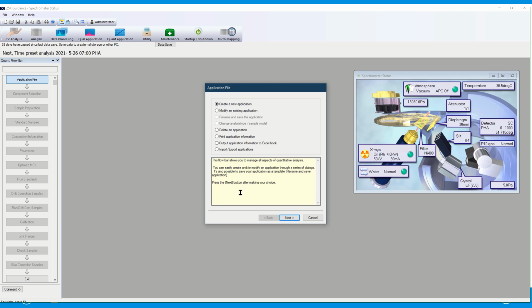So the calibration we ran with these pills before is for the class 1 and 2A, which is your arsenic, lead, mercury, cadmium, cobalt, nickel, and vanadium. But we're just going to do this with nickel right now because nickel is one that we just want to show you as an example. If you're going to do that here, you just pick all the elements in the one method and you do the same thing that we're doing with the nickel. But we're just doing this for time's sake so you can see it live, so you can see it actually happening as we're running it.